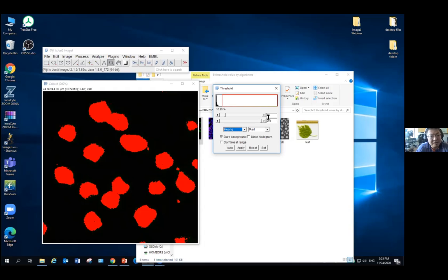In this case, when we do different images, we actually use different values. But we can still say that we treat all the images the same because we use the same algorithm to calculate it. We do not manually, personally, very subjectively, adjust the thresholding to fit our goal. It's not ideal compared to using a single fixed number as a threshold, but we still use the same way to treat all the images the same.